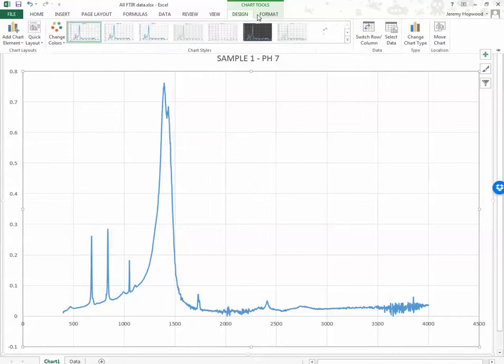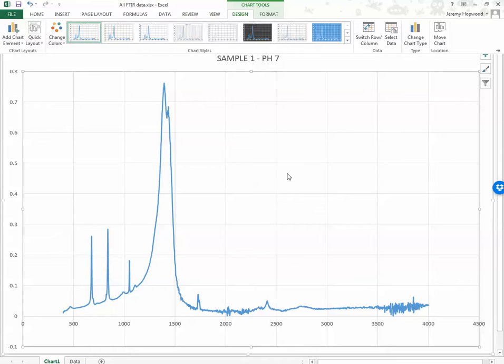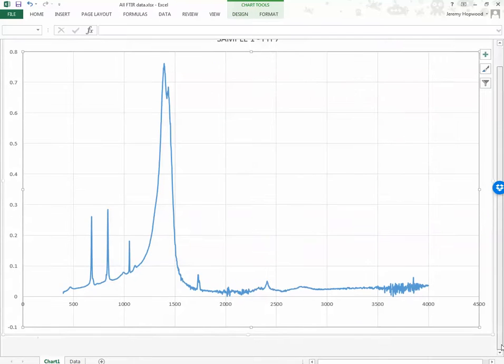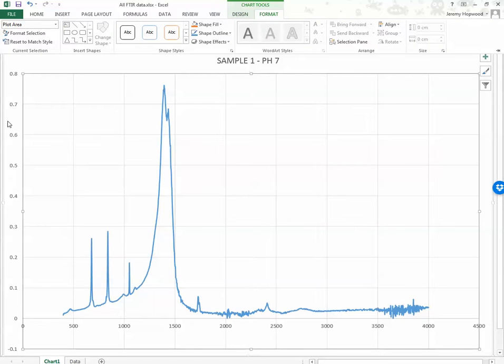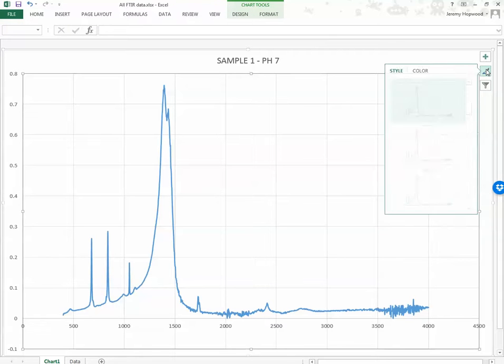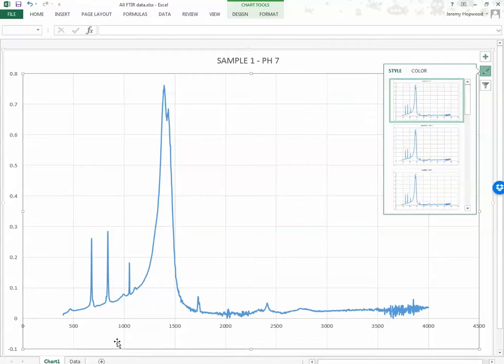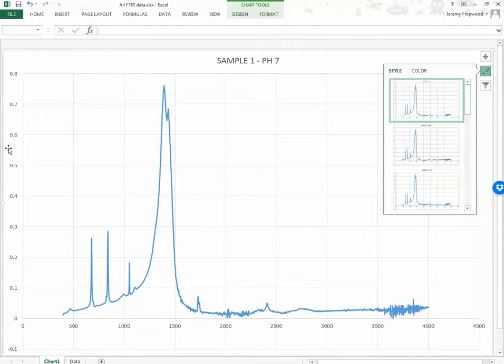So if I go to format, where's it, design, I can never remember on this, design, view, let's try again. Because I've got a new version of Excel, everything's different. So let's move this up. There should be one which is saying something about the axes titles. Design, view, it's usually on design. I don't know what that symbol means. What does that one mean? So series, that's painting. Right click, format plot area. I'm not sure, let's have a look. I think what I'm going to do for a moment is I'm going to pause this video, find where that is.